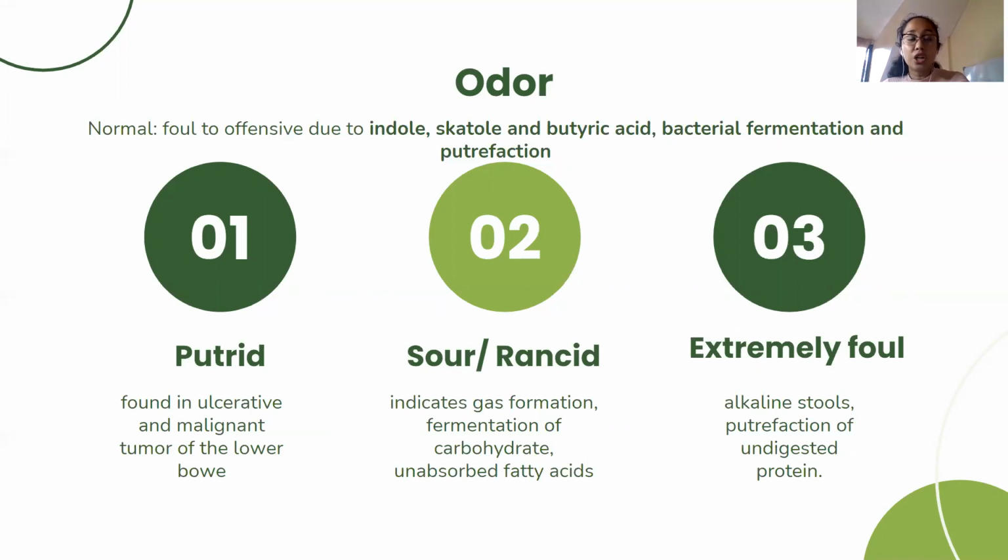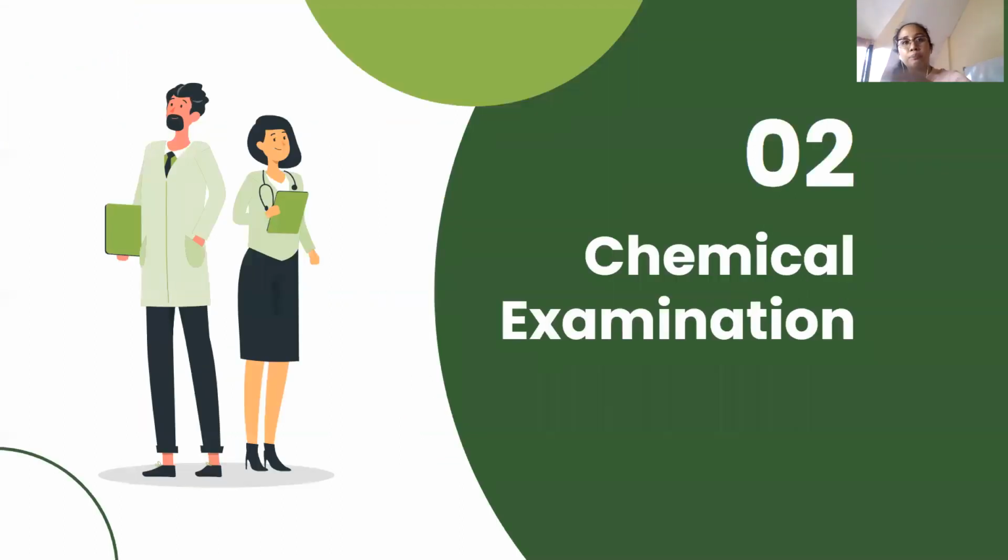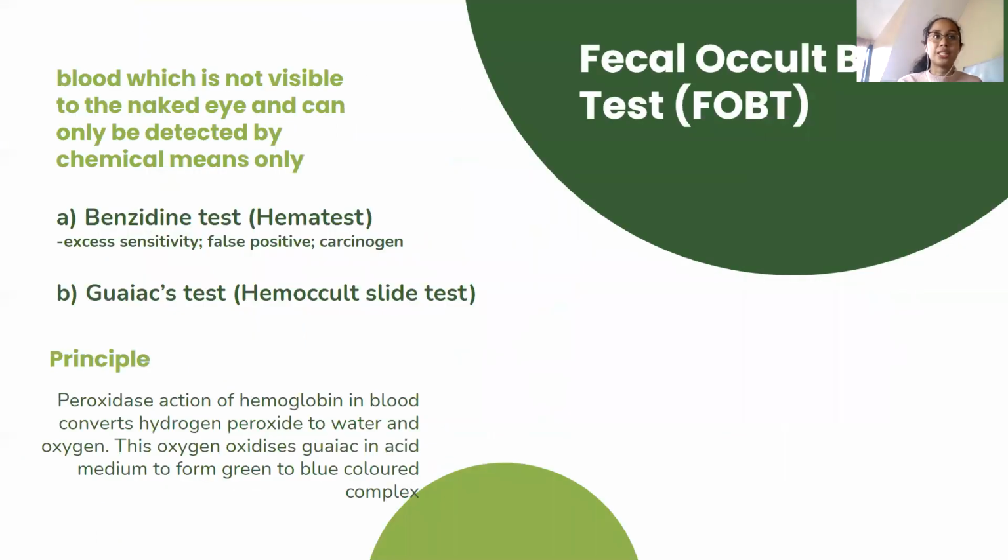Sour or rancid. Sometimes the feces of babies could smell sour and rancid because of breastfeeding. Gas formation, fermentation of carbohydrates and unabsorbed fatty acids, and extremely foul due to proteins. So, chemical examination na tayo, guys.